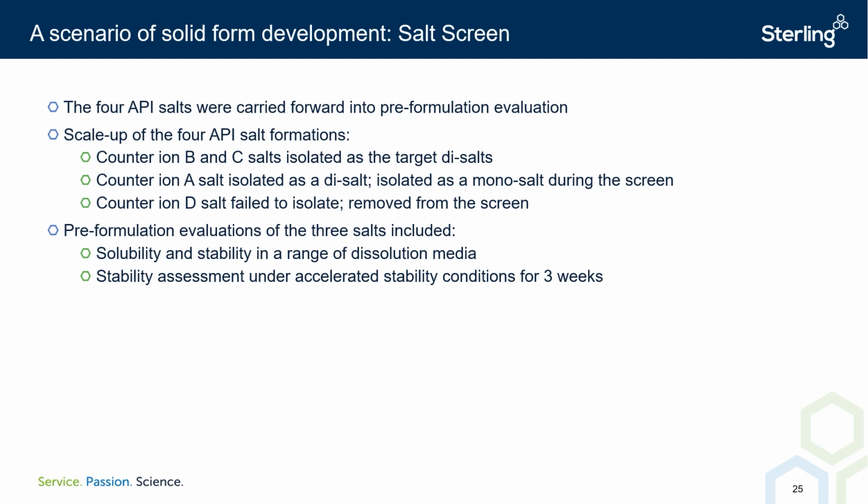With the number of API salt versions reduced to 3, the free API and salt versions were assessed for their solubility and form behavior in various dissolution media at 37 degrees centigrade. Form and chemical stability were also assessed following 3 weeks of storage under accelerated stability conditions.